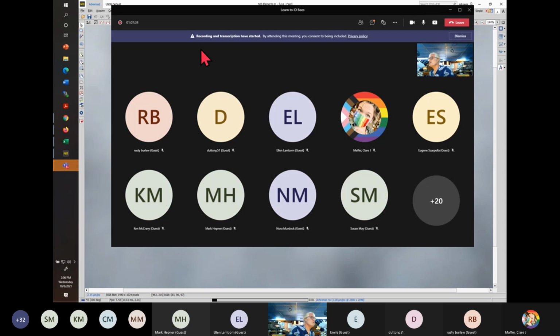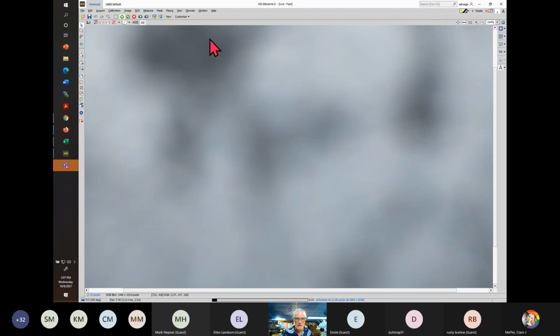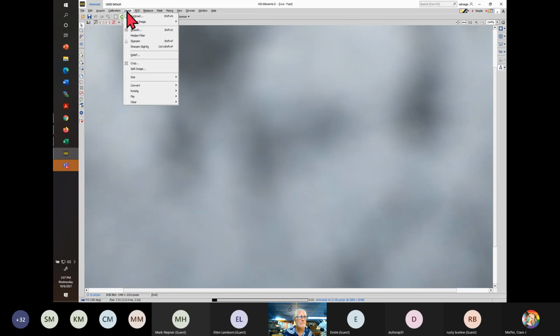So it's a Nikon, and we're using, Craig might be able to say more, our loaner of said microscope, and it comes with really detailed software. I think I can flip. Am I still showing my screen? I can flip to the software here. And you can see, just looking at the top, it might not be super obvious, there are just lots of things here for calibrations, what you can do with the image in terms of measuring, and you can take pictures, and it's really handy.